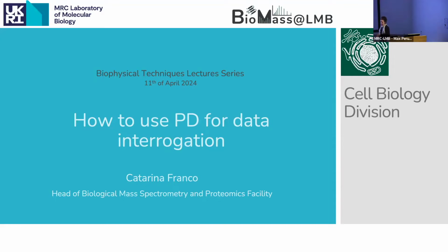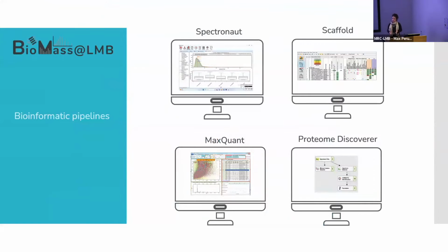So today, I'm not going to speak about mass spec at all. I'm going to speak about one of the bioinformatic pipelines that we have in the facility. We have many, but Proteome Discoverer is one of the bioinformatic pipelines that actually allows us to analyze all types of data. It can do gel band analysis. This is straightforward protein identification.